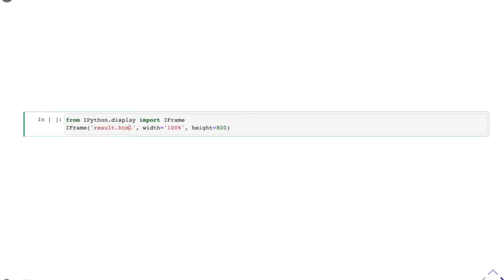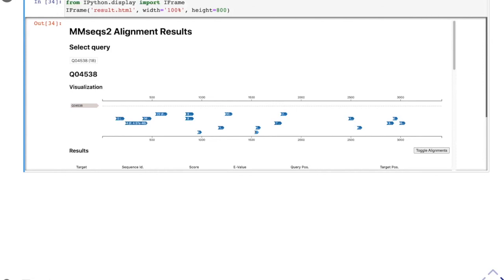And now let's have a look at that result output. We can see now that here is the contig. This is the protein, the polyprotein. And each of these hits is something that was assembled by the assembler. So you can see that only by looking where these hits are, there's quite a lot of sparsity in that assembly. It just hits small pieces of that polyprotein.